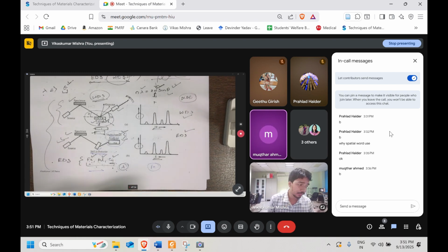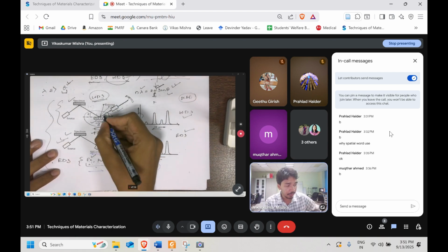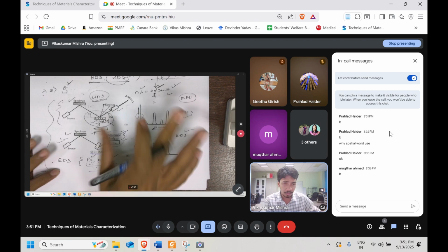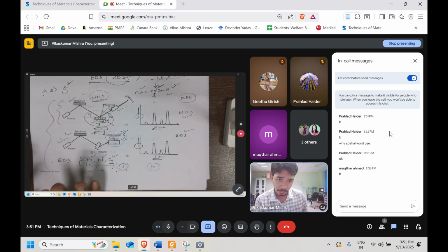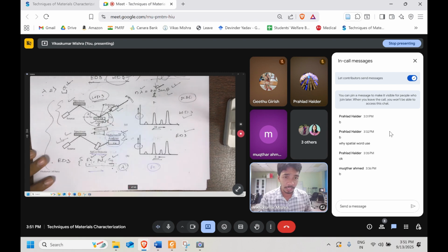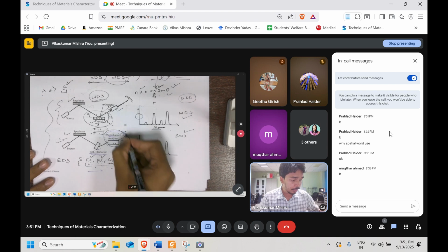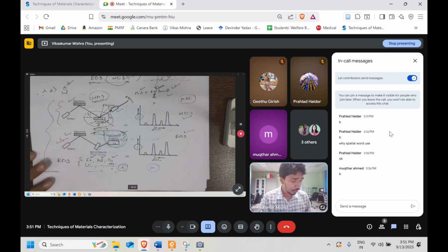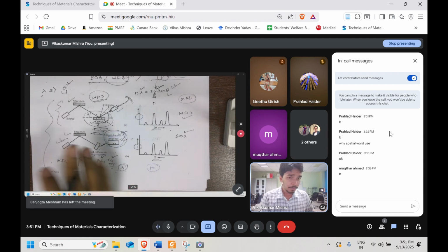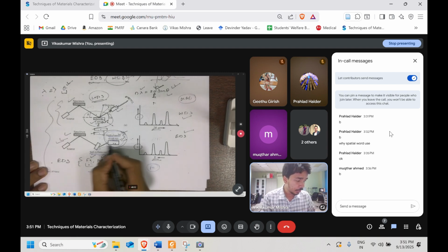Here, what we are seeing is the intensity: at this particular angle we are getting this much, it is very intense. So what we are detecting in the detector is the X-ray. What we are detecting with the multi-channel analyzer is what we have discussed, the PN junction, the number of electron-hole pairs that have been generated. So this is the difference between them.